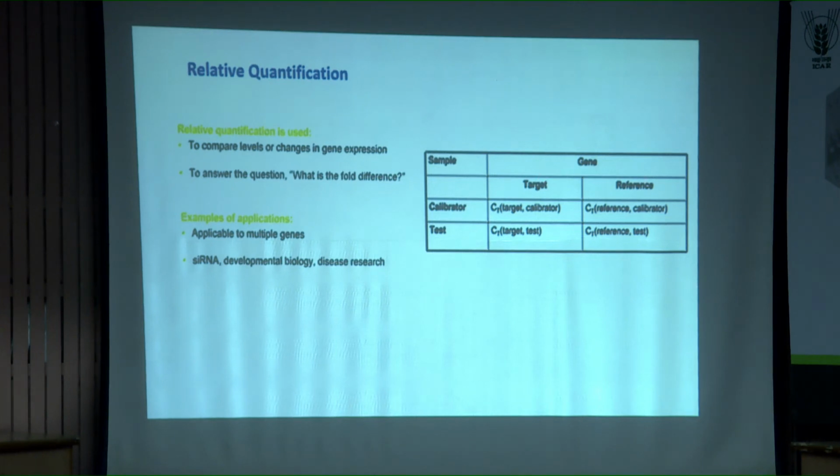And you have a target and a reference. The targets are genes responsive to altered temperature, altered antibiotics, or altered conditions. You did a literature survey and jotted down some genes that are vulnerable to these conditions, and they are your real targets. You also have a reference gene whose expression is not altered at all, whether the fungus is growing at 0 degrees or 50 degrees, or growing with cycloheximide, or growing normally, whatever the conditions. So this is so important for us.